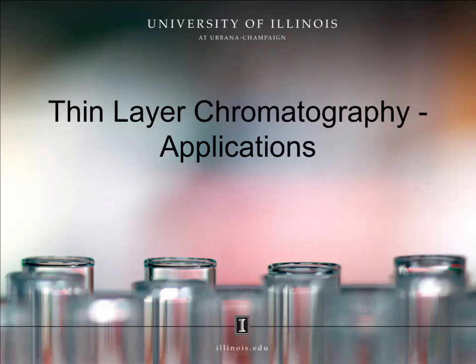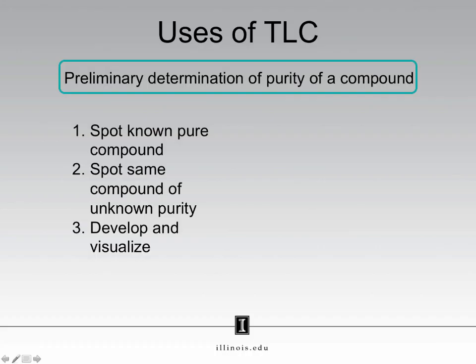Thin layer chromatography, applications. In the previous webcasts, we discussed how TLC works and how to perform a TLC analysis. In this webcast, we will discuss what we can learn using TLC in the laboratory.